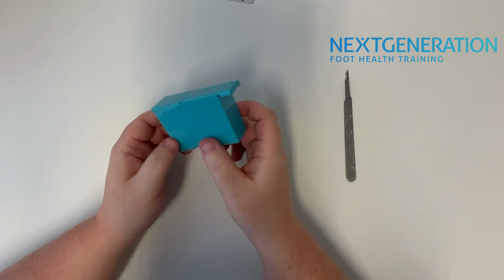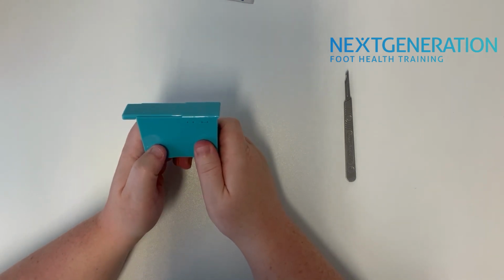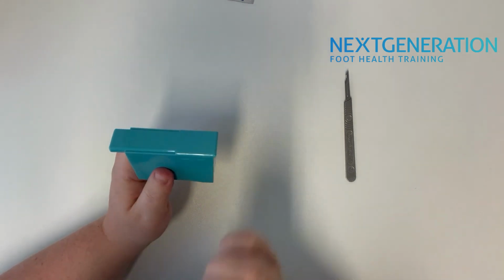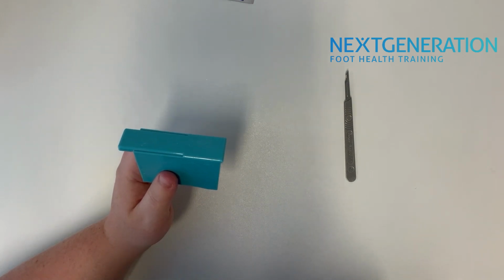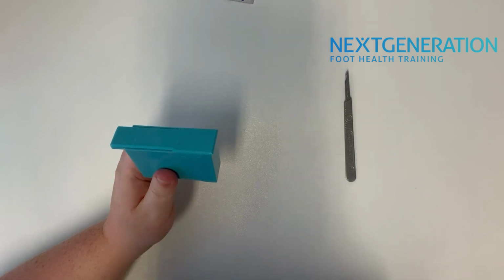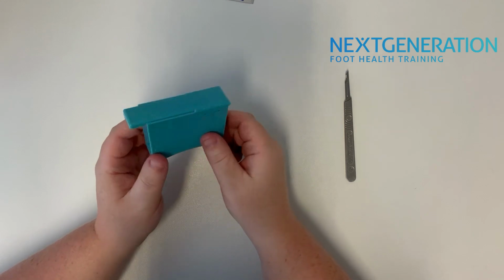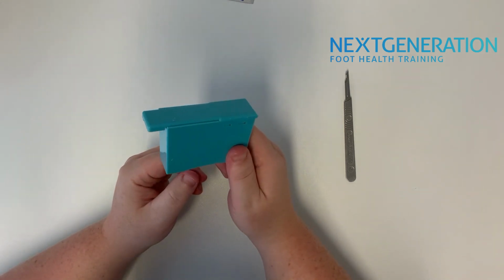If I give it a shake, there's some blades in there. Now they do say that it will hold approximately 100 scalpel blades, but when you come on the course, you'll be dealing with gouge blades, and if you deal with some of the bigger gouge blades, which we'll go through and discuss, they are quite big blades, so they might take up quite a lot of room in there. All I would say is when it feels 3/4 full, you then need to think what you're going to be doing with it.